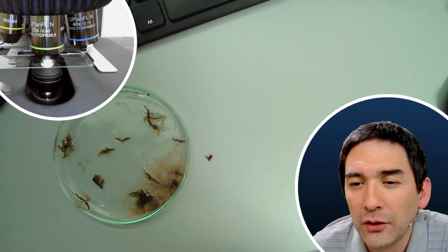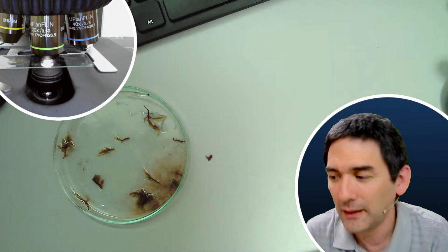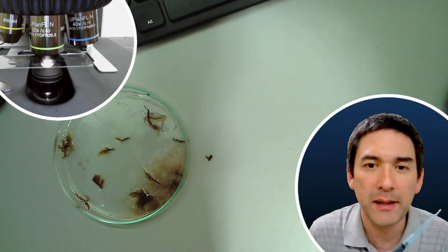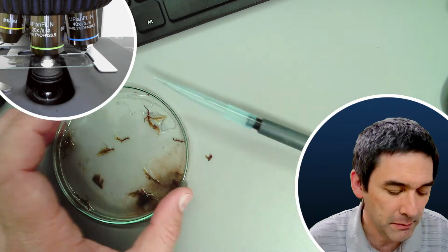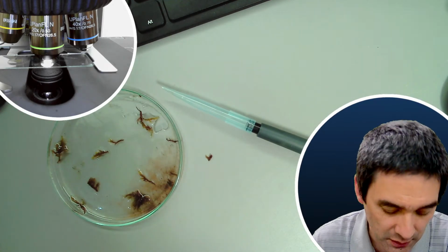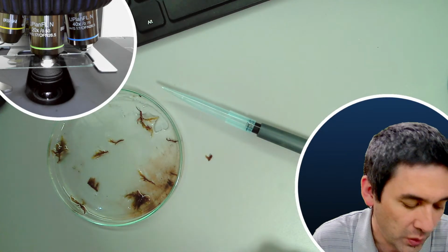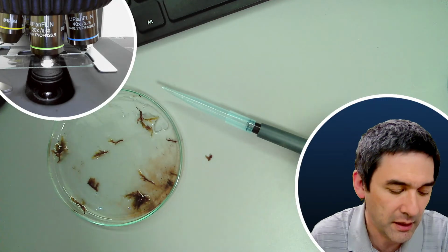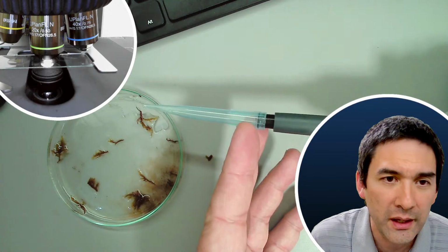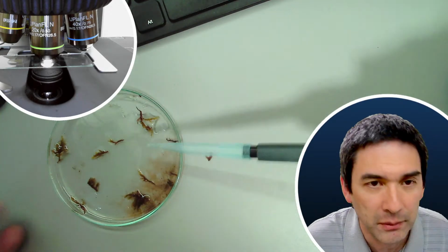Do you reuse pipette tips? Yes and no. Okay, basically what I do is the following. These pipette tips, I can show you here, are not sterile, and they don't have to be, because I'm not growing microorganisms. So what I usually do is I have some water somewhere and I rinse it out, because what's the point of throwing it away when essentially tomorrow I'll be picking up the same sample again.